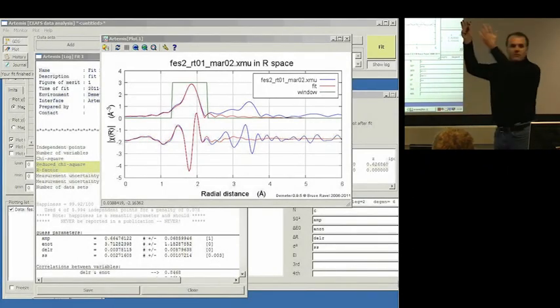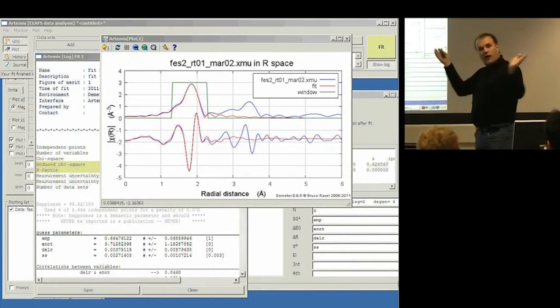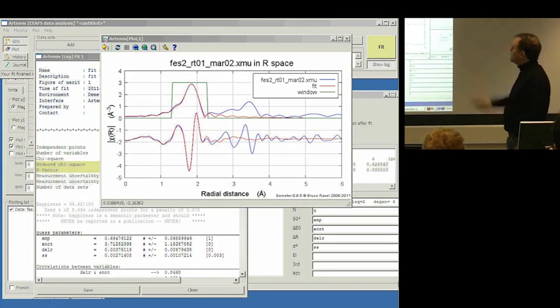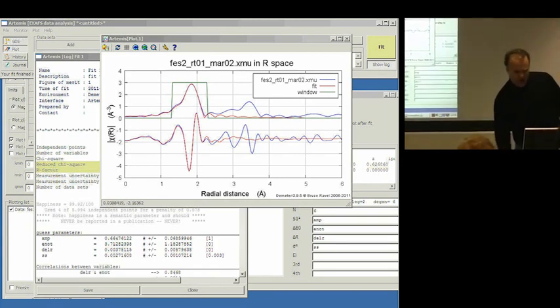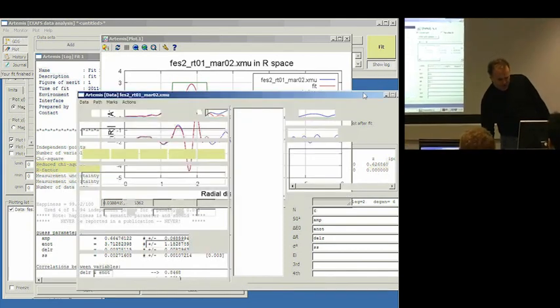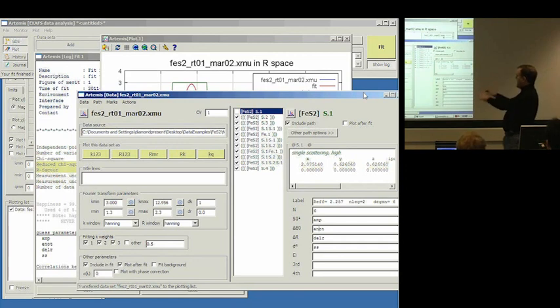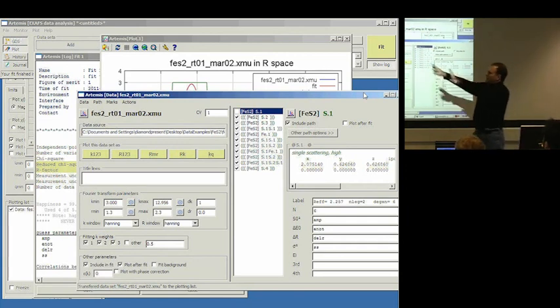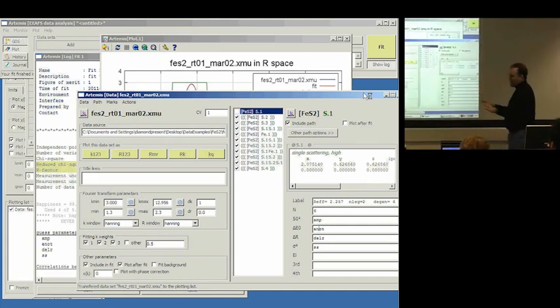So what we have here is fine. It's good. Everything is great about it, but it's not the whole story. We really need to move on. As we showed before lunch, we're going to need to include some number of these paths and then figure out how to deal with all the mechanics of the program to set up the parameters so that we can evaluate the EXAFS equation for all of the paths.